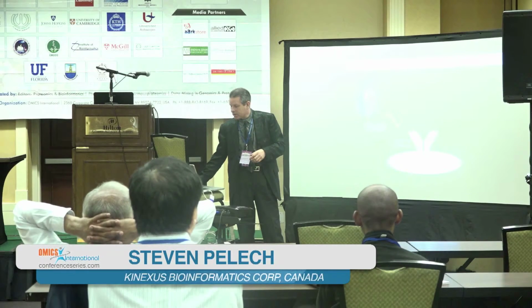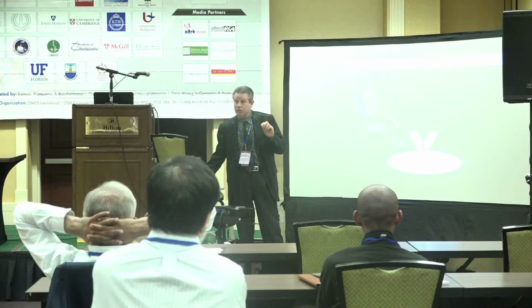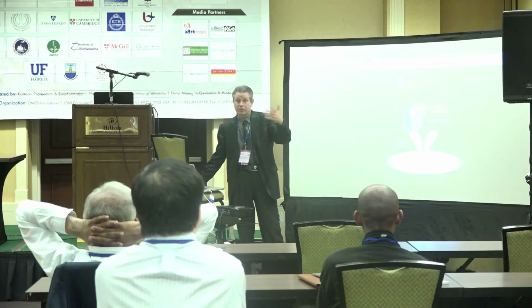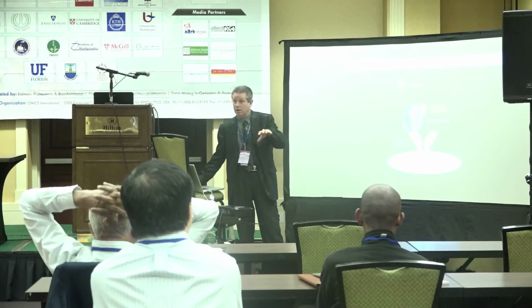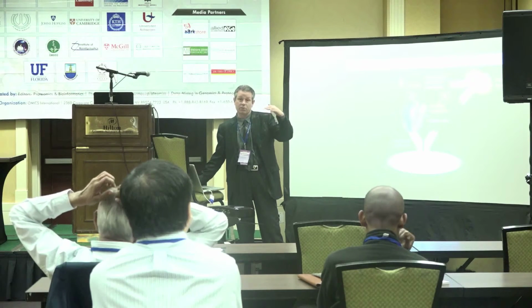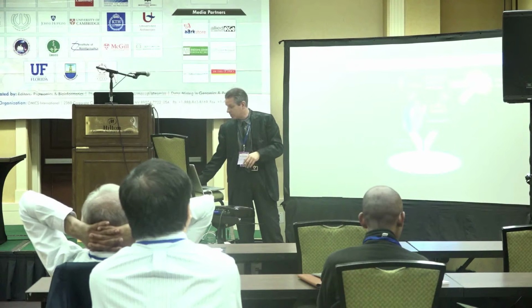So one of the things that this approach with the FSBA can be adapted to is counter-screening for kinase inhibitors. What you can do is capture the kinase like before and have the kinase inhibitor incubated, and then you add your FSBA probe. If many of these kinase inhibitors are ATP analogs, then they block the active site. So the probe will not bind, and therefore you won't get binding of your fluorescent dyes. So for those signals that are reduced in the presence of the inhibitor, they're likely potential targets.